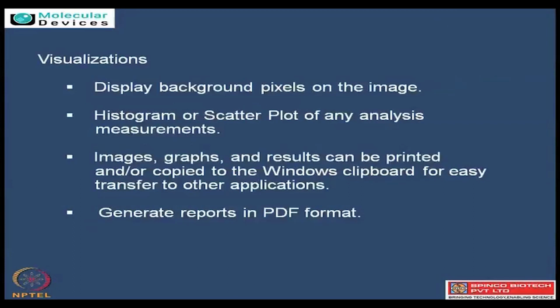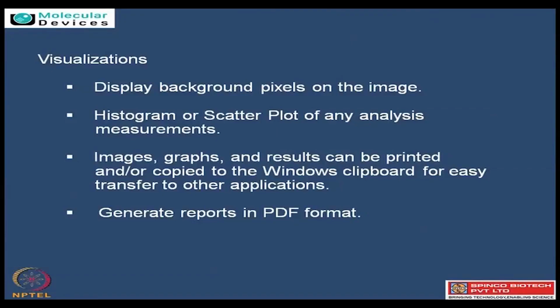Once the image is acquired, the scientist immediately wants to know how my data has performed. Especially, a few people even use bacterial controls, which are non-related to the biology as such. They totally want to see just the assay controls. First they ask whether my assay has worked or not. The best way for them is looking at the graphs which give differentiation at the level of backgrounds, and this can also be done with different histograms and scatter plots.